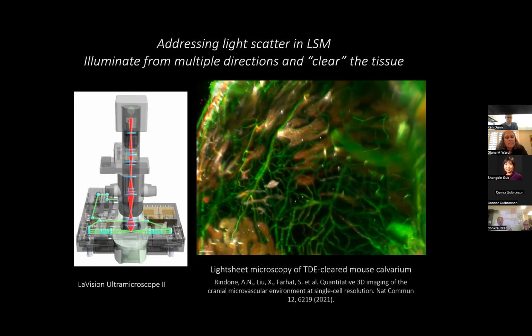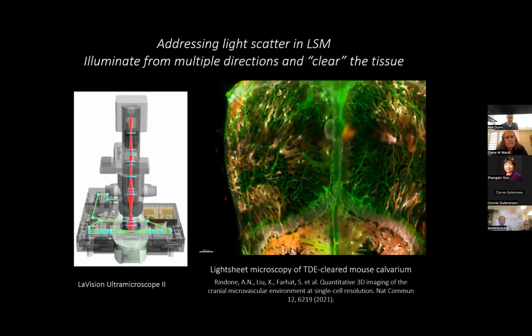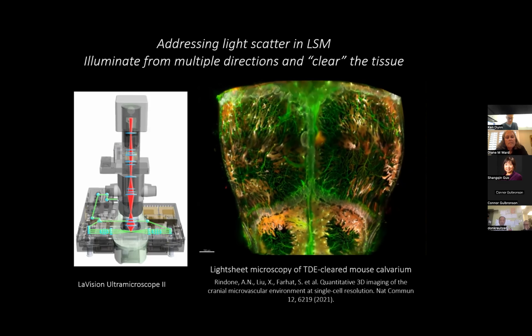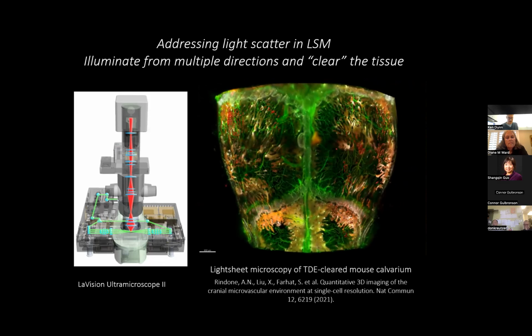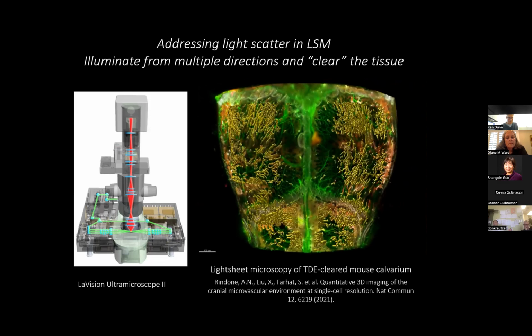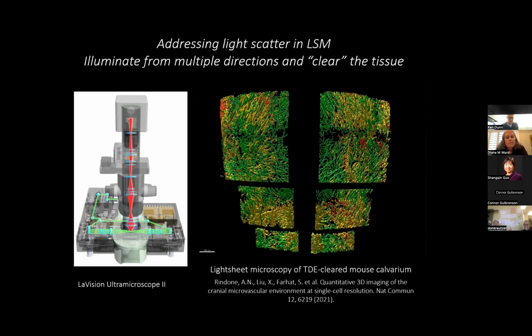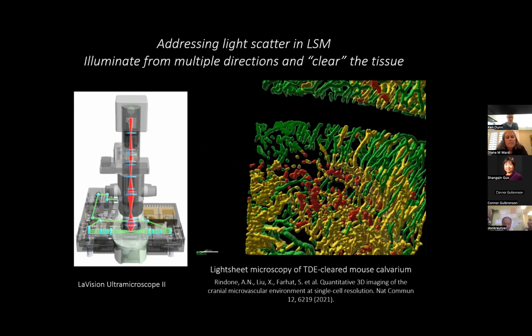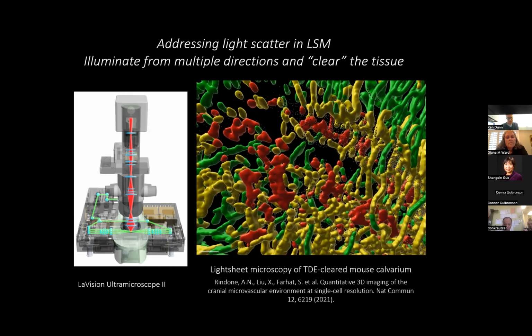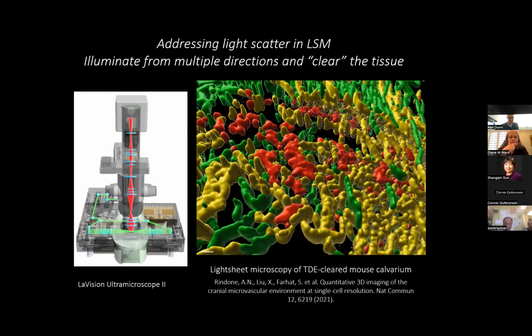And so there are two things you get out of this. First of all, the scope of the image. This is the entire calvarium, I believe, and it is imaged at cellular and subcellular resolution. What they're showing here is segmentation of various regions. So you do image analysis to segment out different kinds of objects. And again, this is an enormous amount of information you're going to be dealing with here.